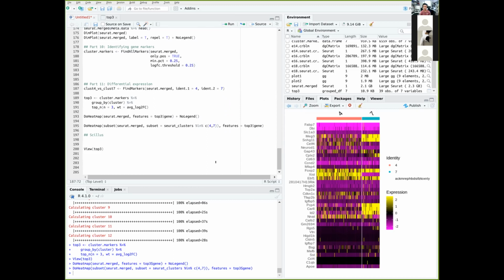and you can plot out. You can view all of these lists of genes using heat map as well, or using volcano plot or dimensional plot, as how you're very familiar when you look at papers that plot out single cell RNAseq data. Right. I think that's about it. That should be the last part, because volcano plots, I'm not going to show the volcano plots because we've already seen how we do volcano plots previously and all the arguments that you can actually give to the function. So I think we can stop here.